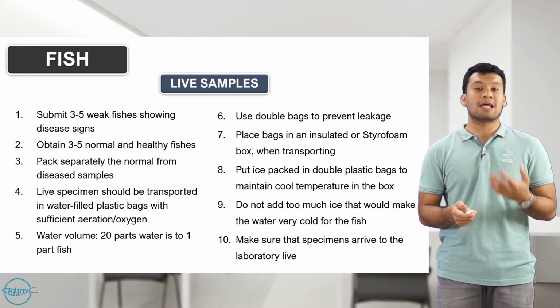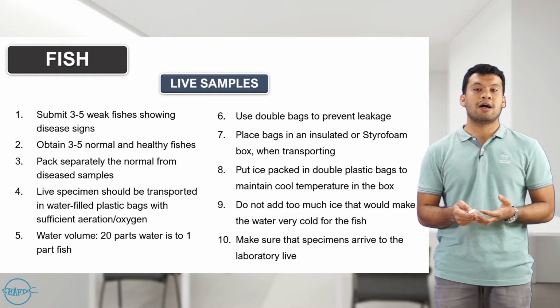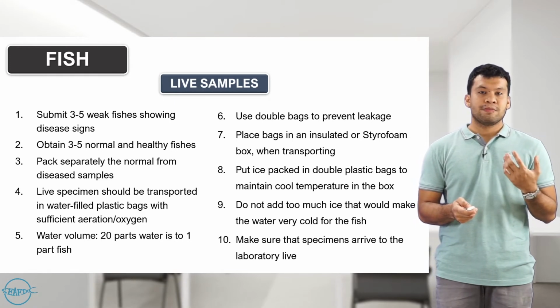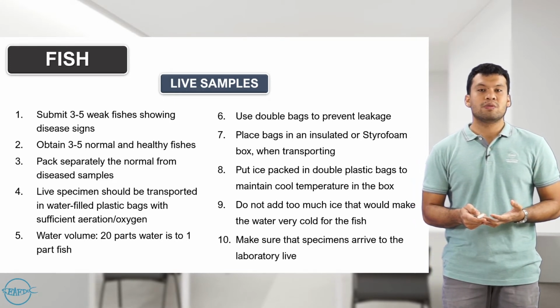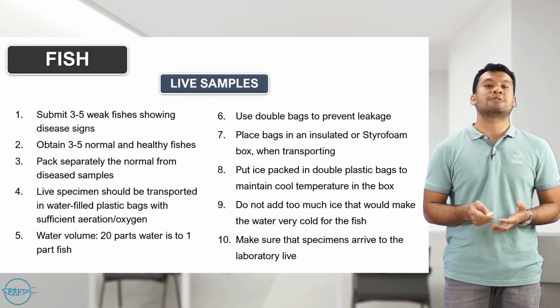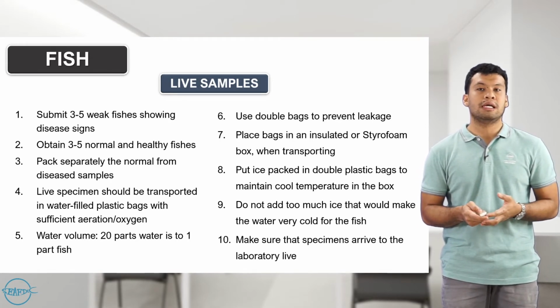Do not add too much ice, so that the temperature in your packed sample would not be very cold. And always consider this: make sure that the specimens arrive at the laboratory live.